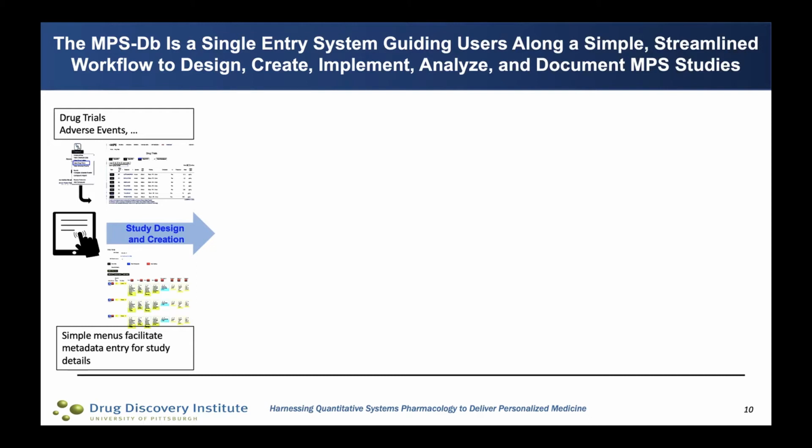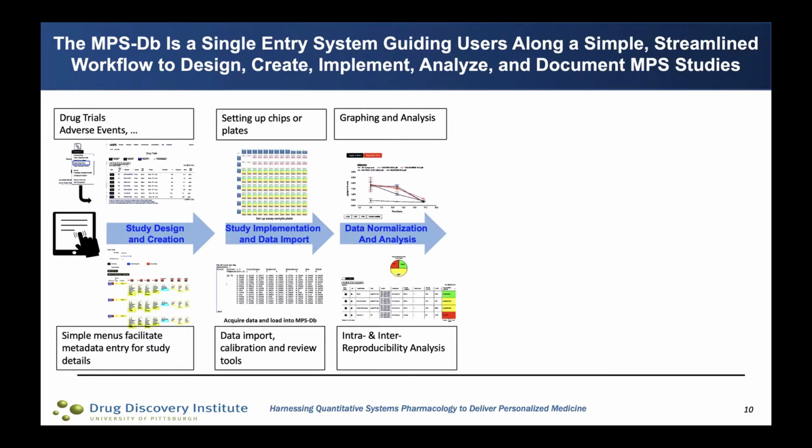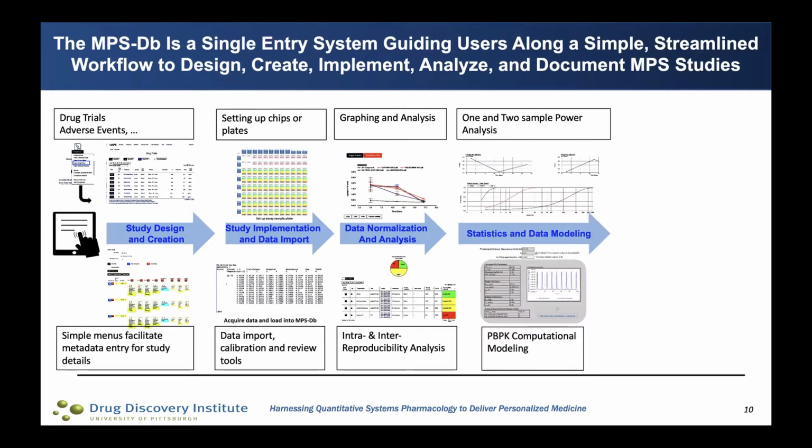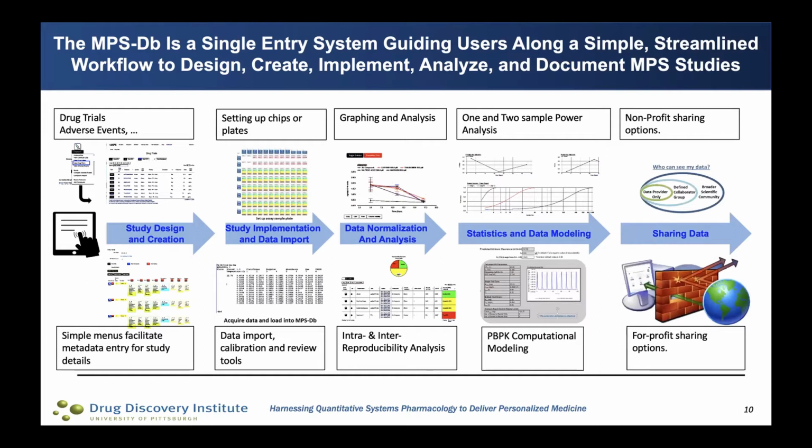Starting with the design of the study, the configuration and setting up of all of the chips or plates that go into the study, the analysis and processing of the data that's generated in the study, the evaluation of the study and tools like power analysis that can be used to optimize studies for the next round, and then a means to share all of this information and data amongst either specific collaborator groups or to the scientific community in general.